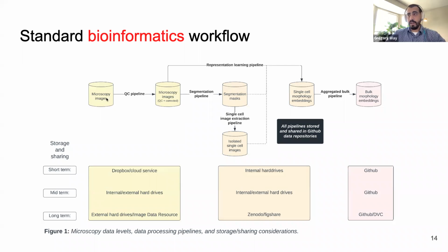So we take these microscopy images, we perform a QC pipeline to adjust them and make sure that we're analyzing the cleanest possible data and removing all known artifacts. And from there, we have a couple of decisions to make. We can apply representation learning pipelines, which I'll talk about in the next couple of slides. And then we also most commonly perform a segmentation pipeline to identify the boundaries of the cells. And from there, we get these masks that are output, which are going to distinguish background from foreground. And then there's an optional step here, which I won't discuss.